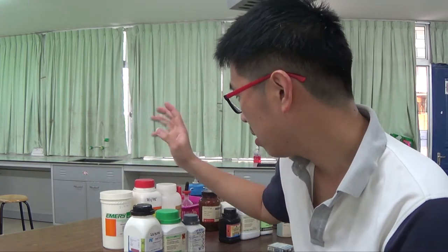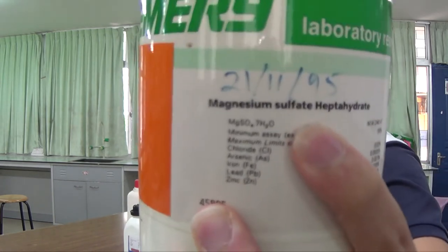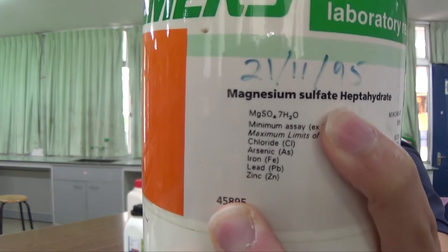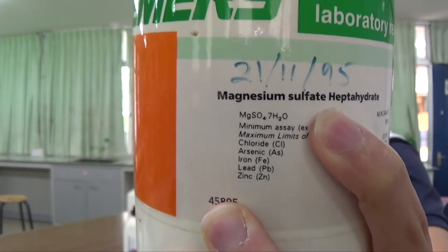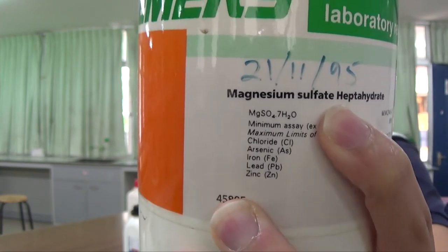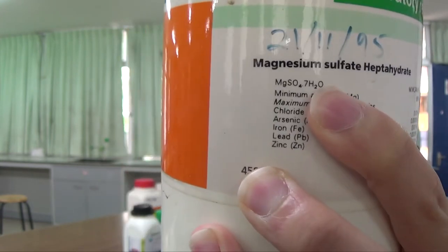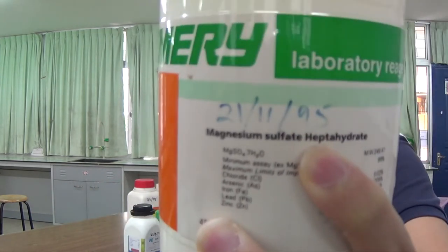So I'm going to show you a little bit of another hydrated compound. This is magnesium sulfate, so Mg2+, SO42-. So 2+ and 2-, the charges cancel. So 1 Mg2+, 1 SO42-. The formula of magnesium sulfate is MgSO4. Here it says hepta. When you have done organic chemistry, you have heard of heptane, heptanol, heptene, whatever. H-E-P-T, hept, refers to 7.